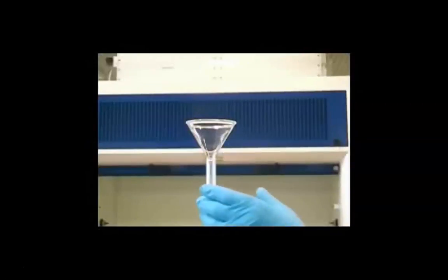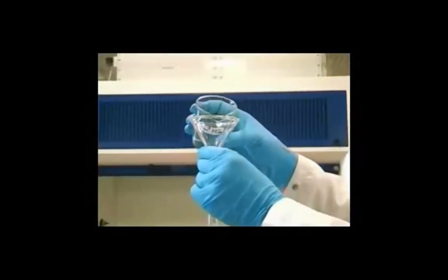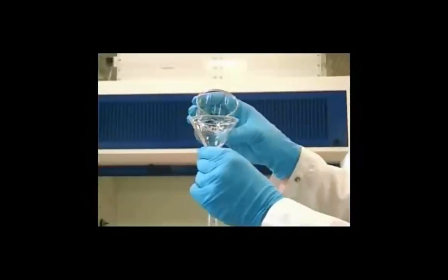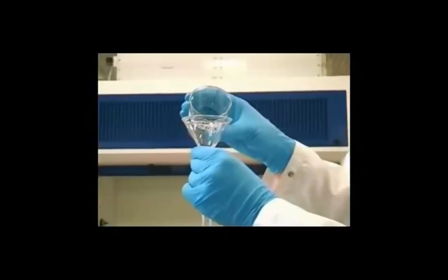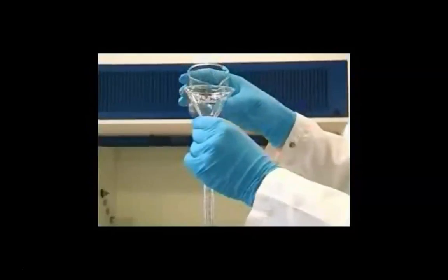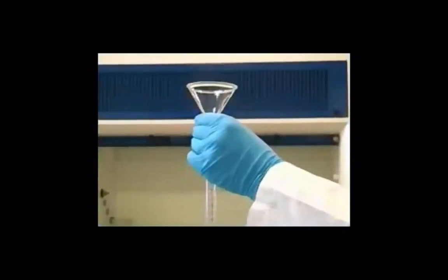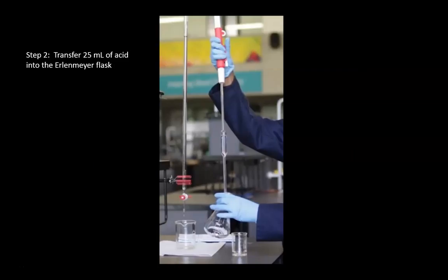A funnel is used. Notice how it is lifted slightly. This is so that we don't get blockage of the liquid at the top of the burette. Make sure the stopcock at the bottom is closed before you start this. The sodium hydroxide is poured up to roughly the 0 milliliter mark. It doesn't have to be exactly at 0, but we do have to record the exact volume as our initial reading.